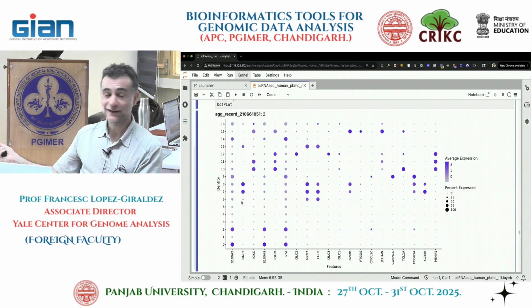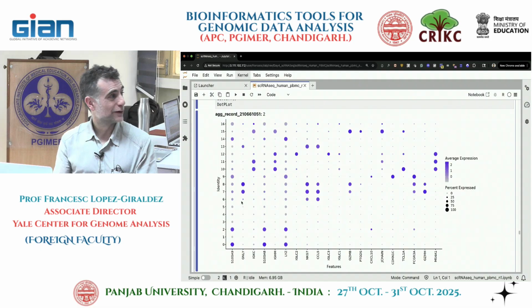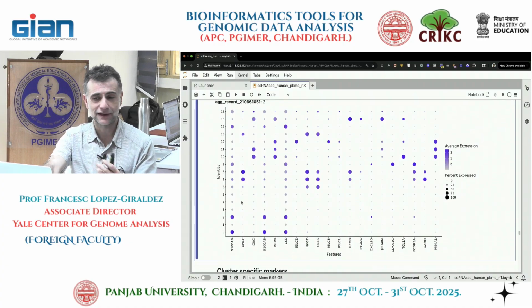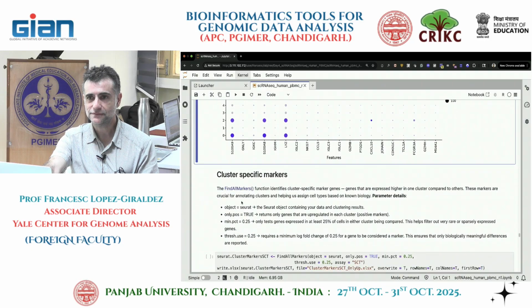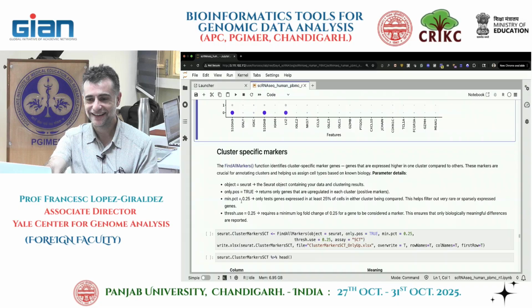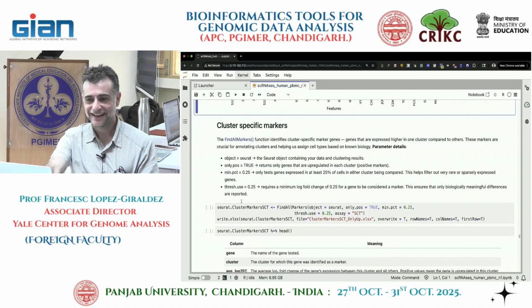So, yeah, any questions about dot plots? So we've seen violin plots, we've seen feature plots, the dim plots, and the dot plots. I think we cover pretty much all the basic plots in Seurat to explore the data. Except if I forgot any, probably. And it was good that everyone could do it on time. I was very skeptical whether it is going to work for everyone.